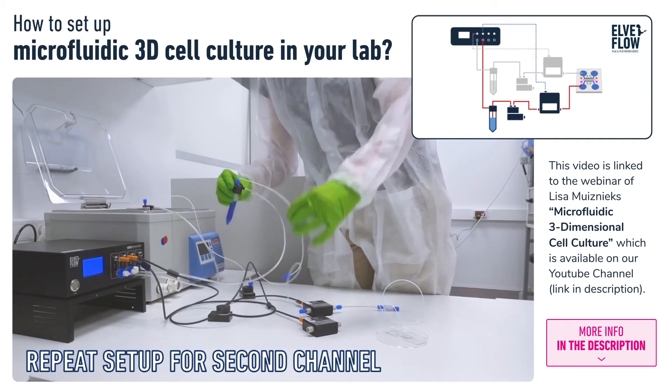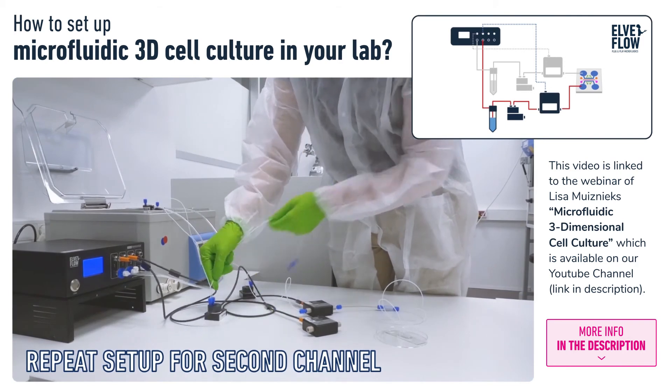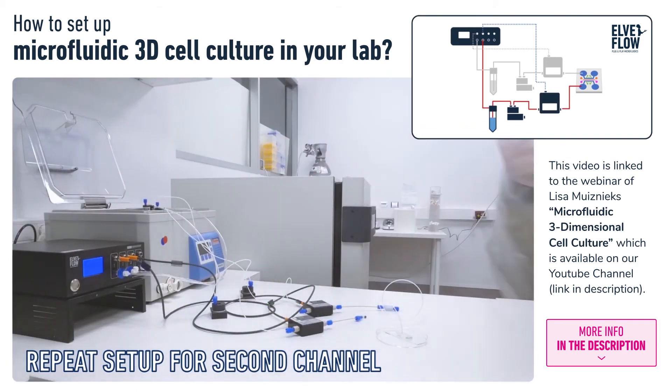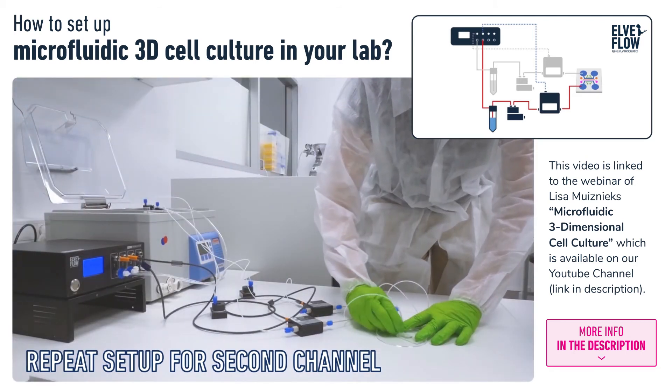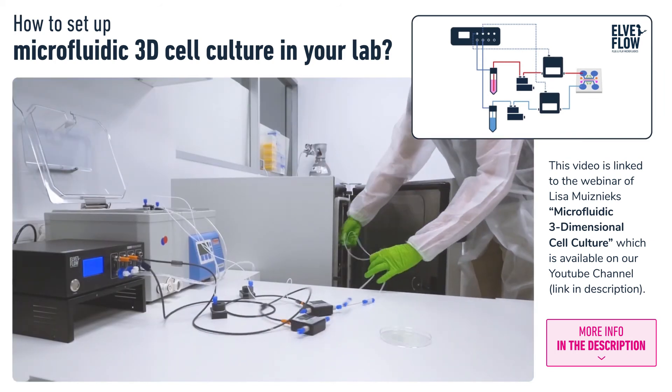To add flow to the other side channel, we duplicate the setup by connecting a second liquid reservoir, bubble trap, flow sensor, piece of resistance tubing, and finally to the second side channel of the chip. The tubing is cut long enough to be able to move the chip into a CO2 incubator.